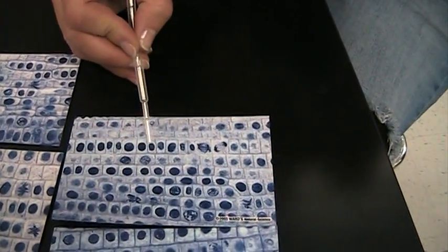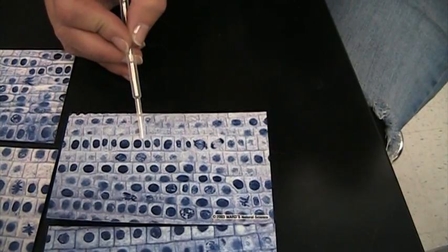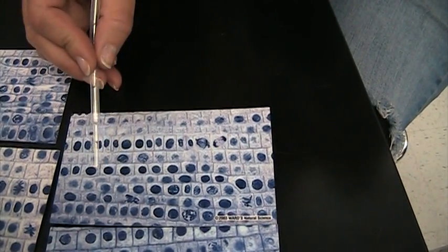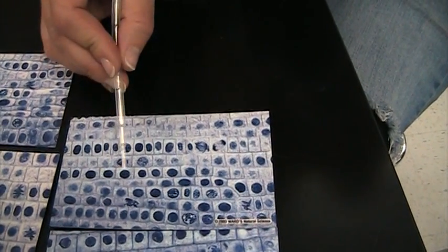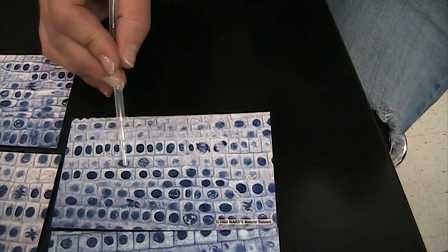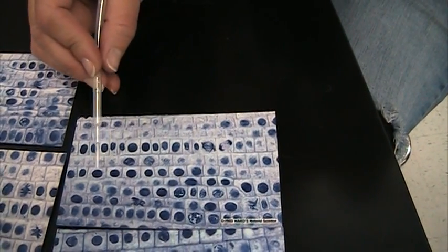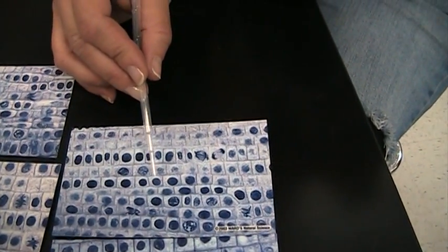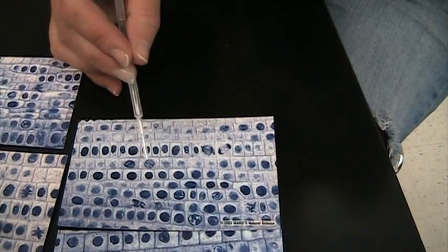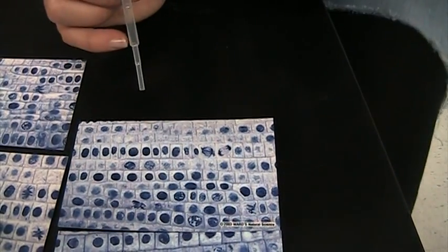Interphase are just going to be these really dark ones where you don't see anything too descriptively. All of these along here are interphase. Interphase is where the DNA is replicating and you have some things going on in the nucleus, but you don't really see too much in the pictures.